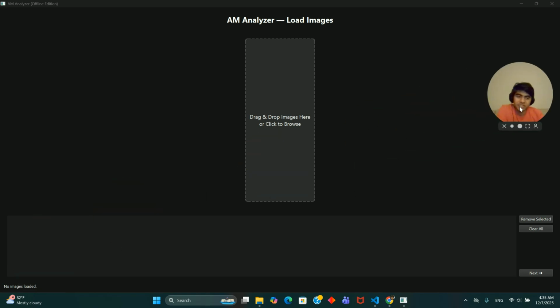So before we even start, as you can see, this code has a GUI, which makes it very easy for different labs or new labs to use this code right away with very little training. And I think that's a very important feature for a general tool.